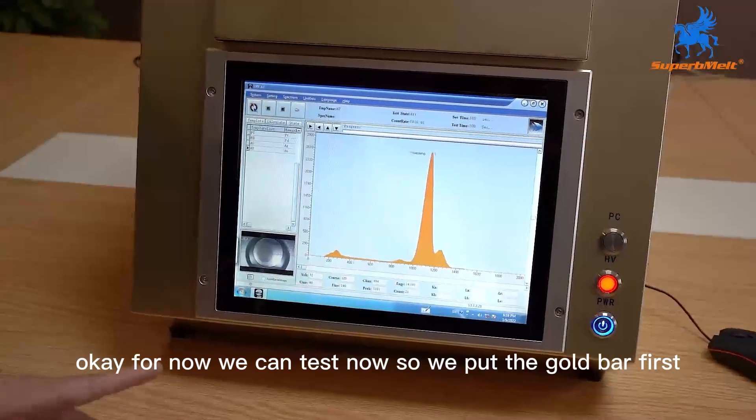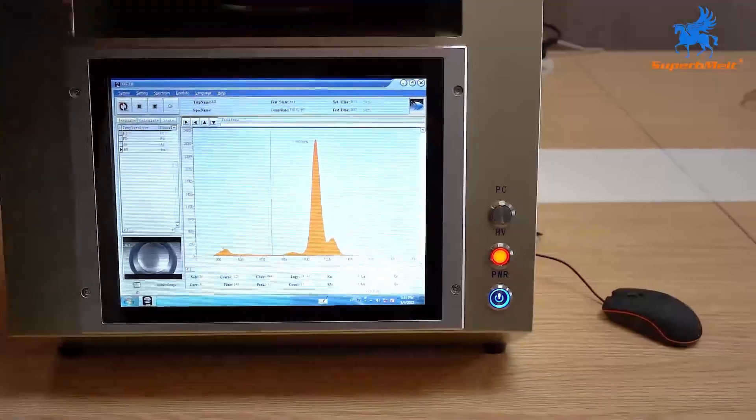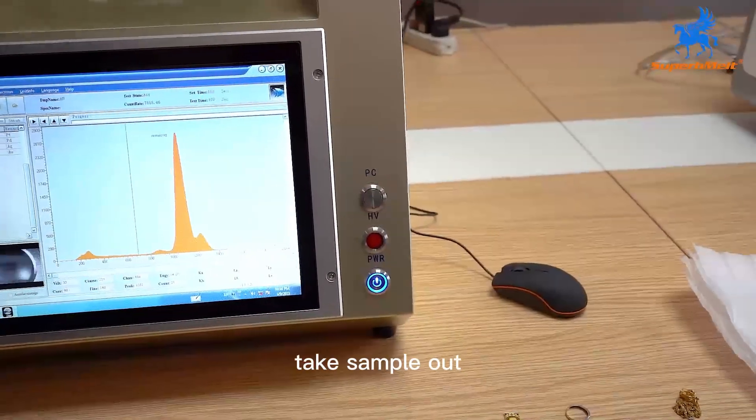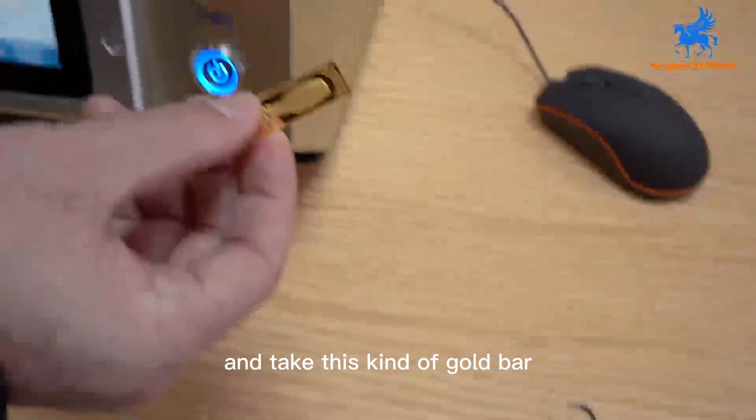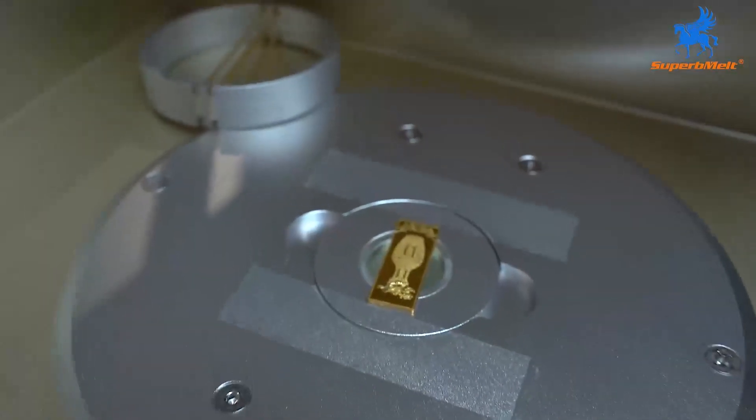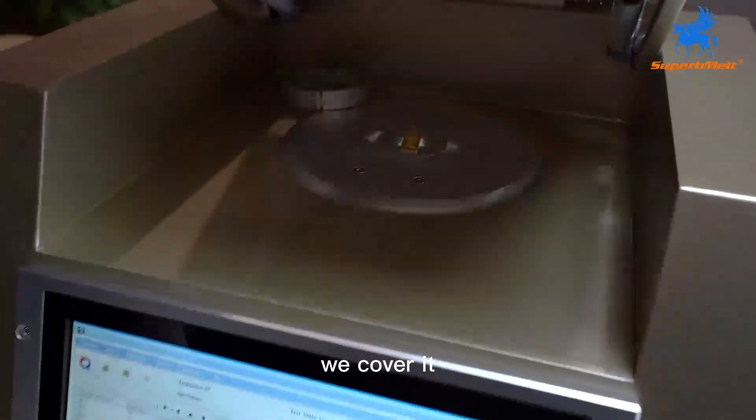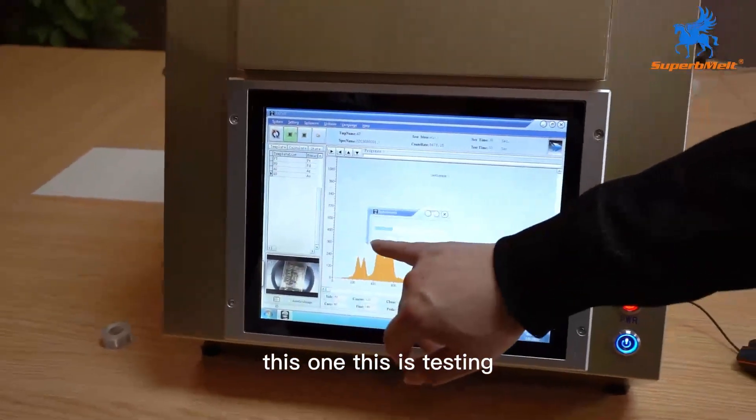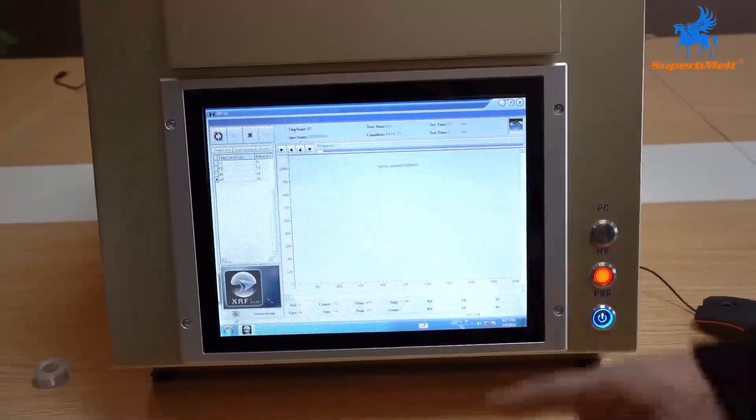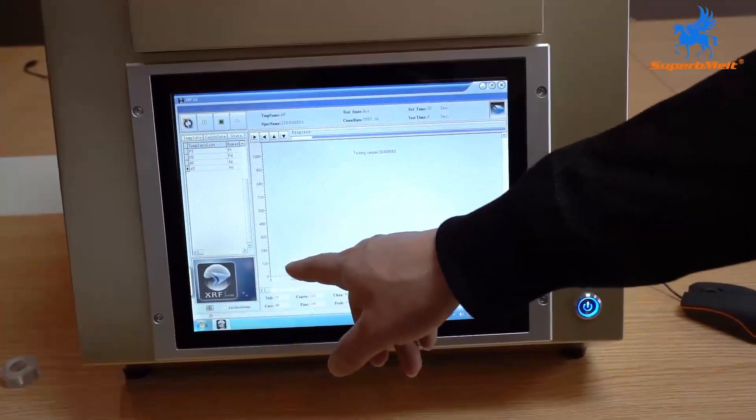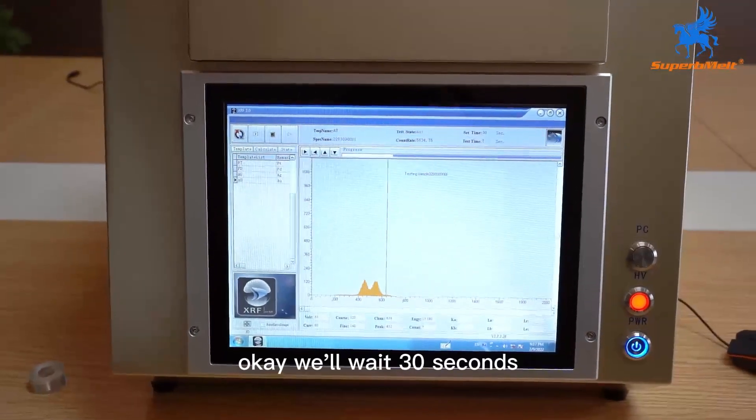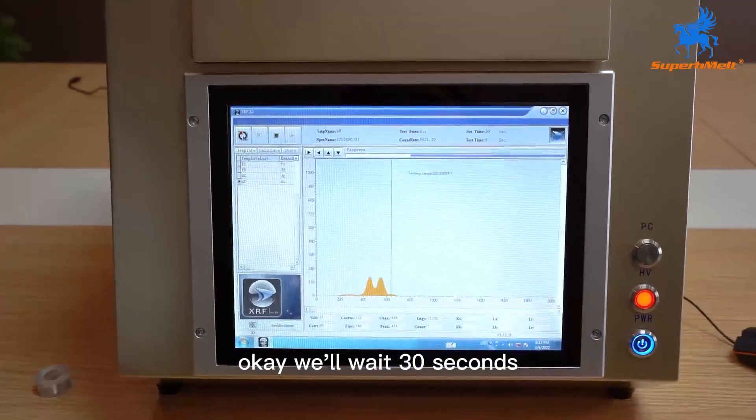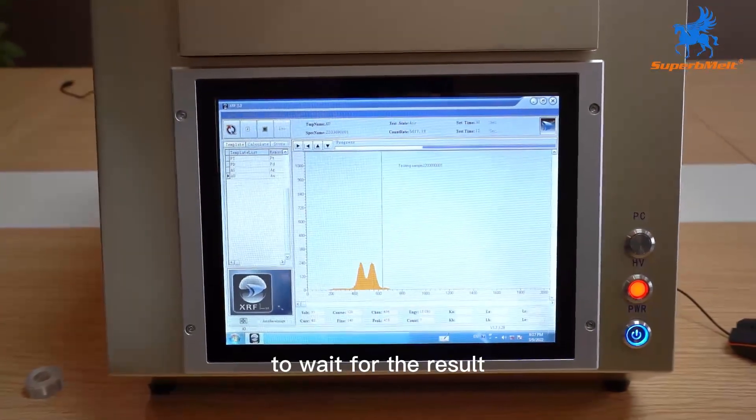For now, we can test. We put the gold bar first. Take samples out and take this kind of gold bar into the center. We cover it. Press here. We'll wait 30 seconds to wait for the results.